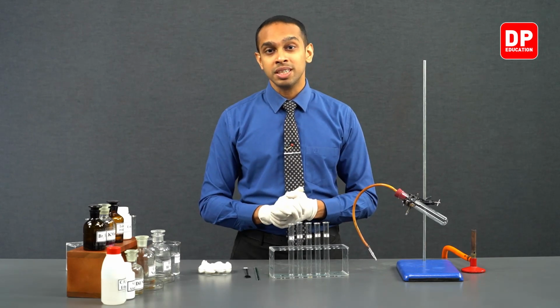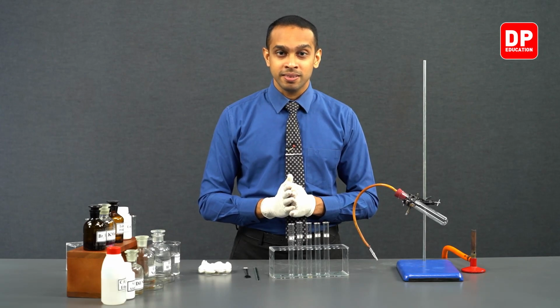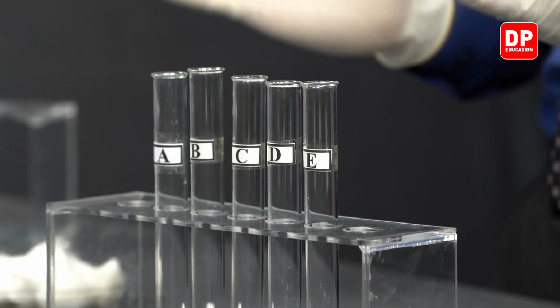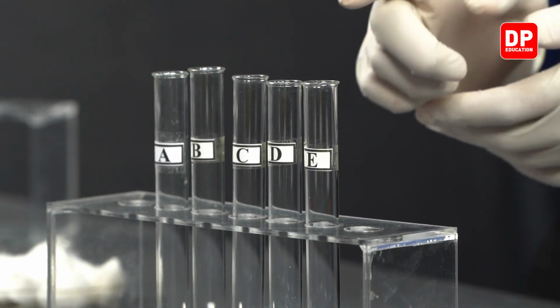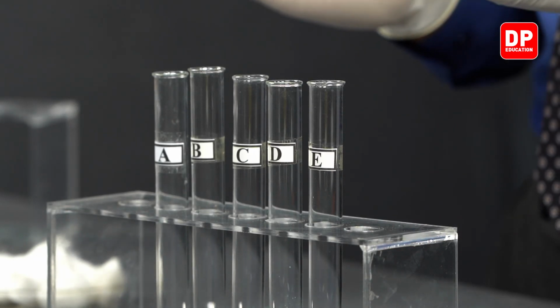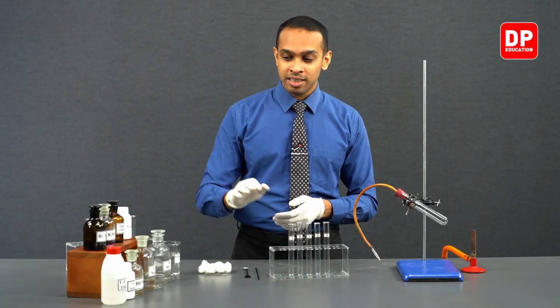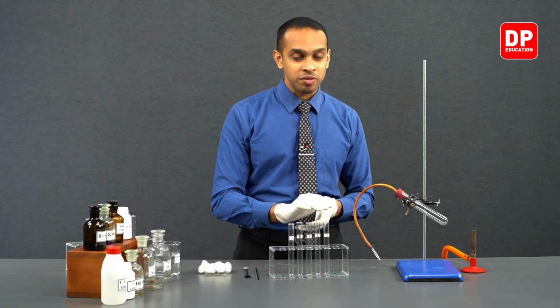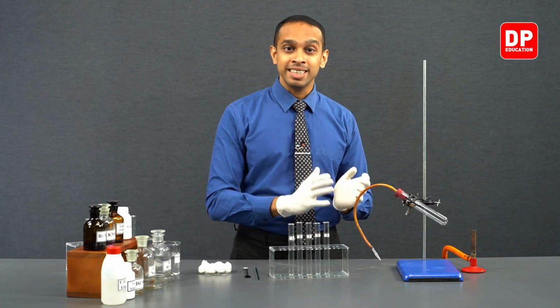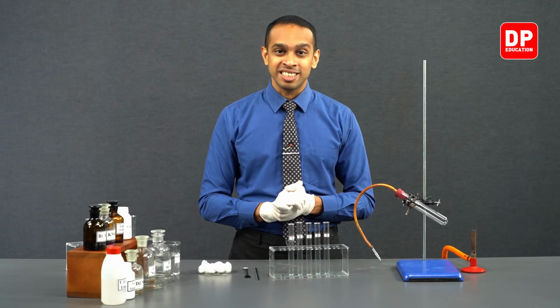To test tube C, acidified potassium permanganate. To test tube D, ammoniacal silver nitrate. And to test tube E, ammoniacal cuprous chloride. Students, let's take each of those reagents into each of those test tubes first, and then we can move on to producing ethene gas and making it react with each of these reagents.